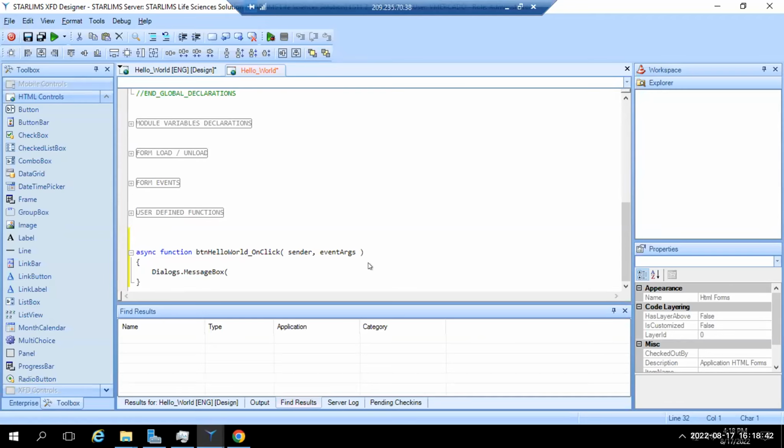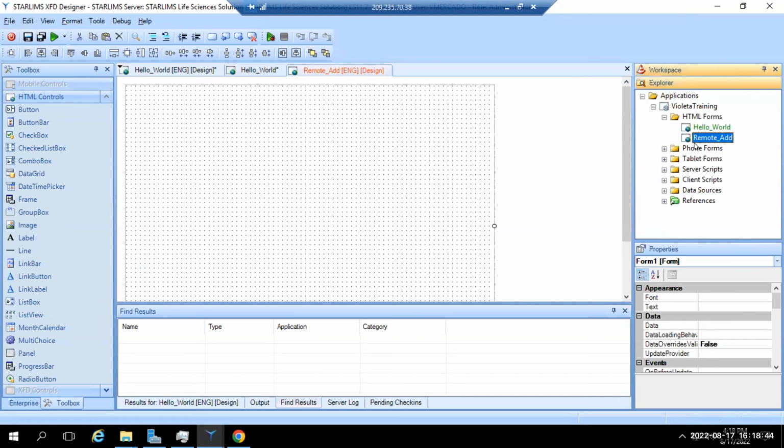All right, Violeta. So you're tasked with adding 2 text boxes. So I'm going to draw it for you before you do anything else. You're going to say first number and then second number. And you're going to have a button here that says add. And you're going to have a result here. And then another text box. Okay, so text box, label, text box, label, text box, label, text box, a button add. Go ahead, please. Start doing that.